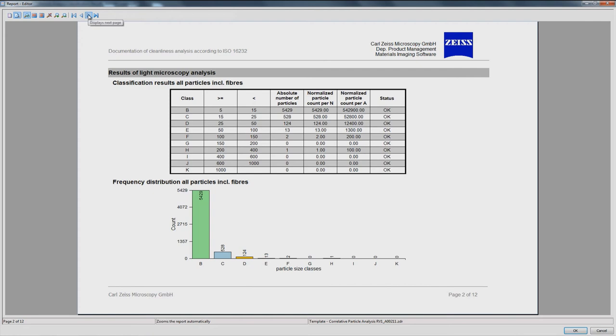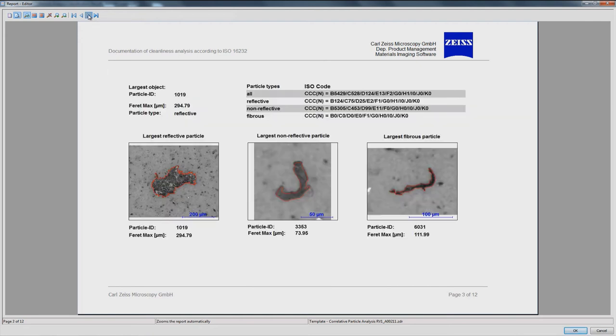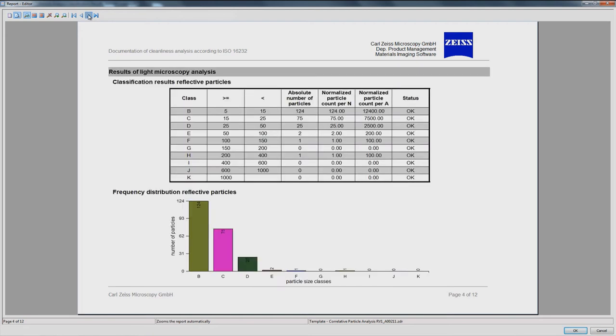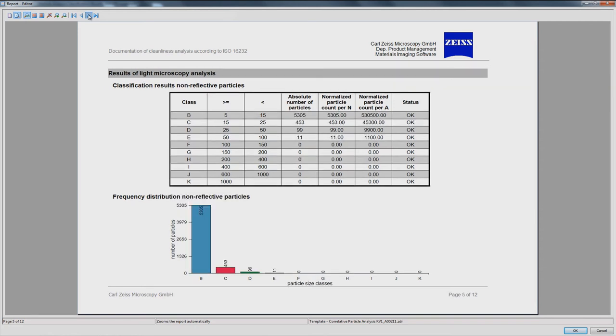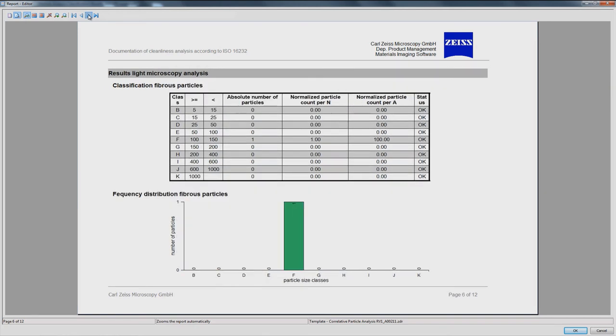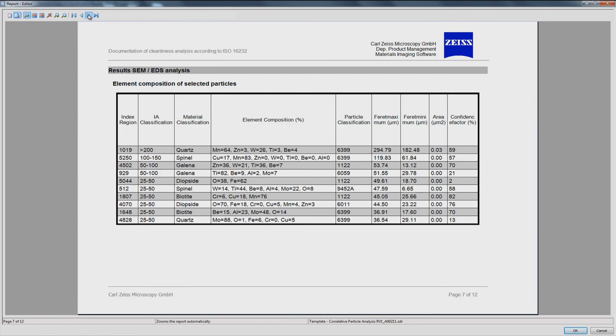you can generate a report with combined results from your optical and electron microscopic analysis. It supports ISO 16232 and VDA 19.